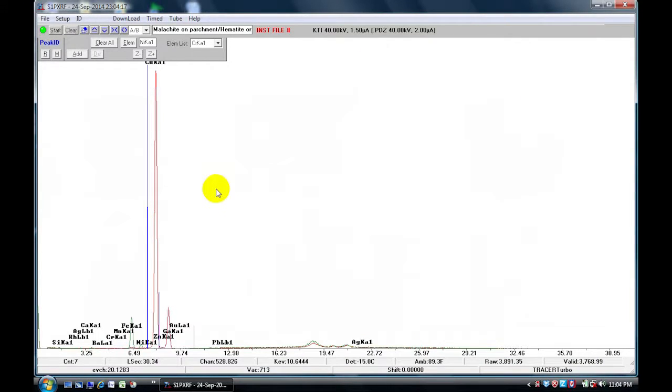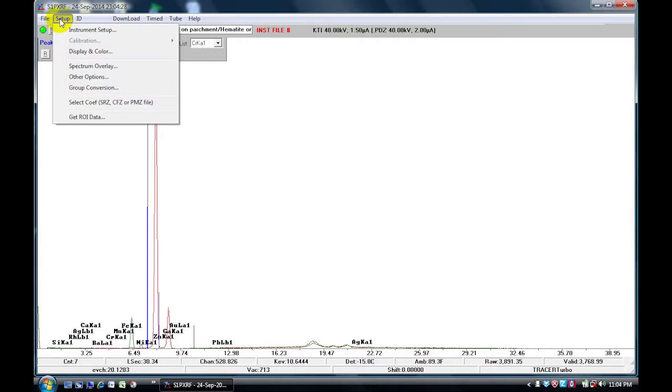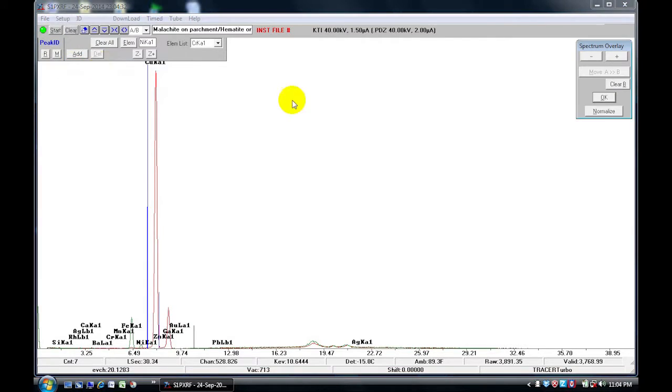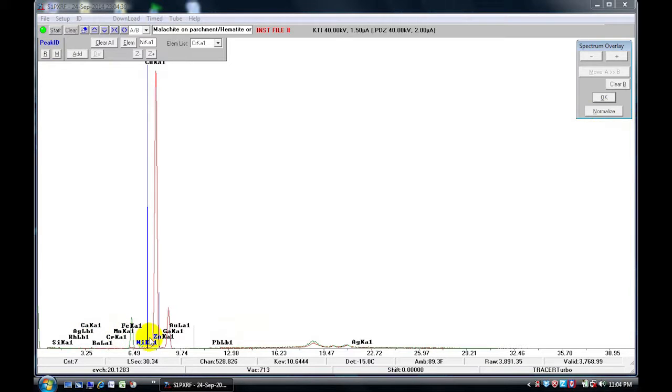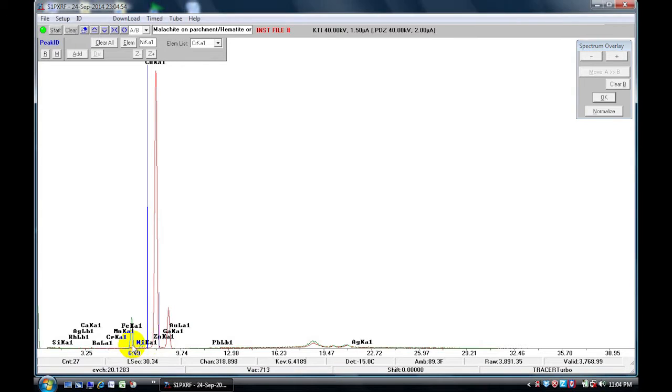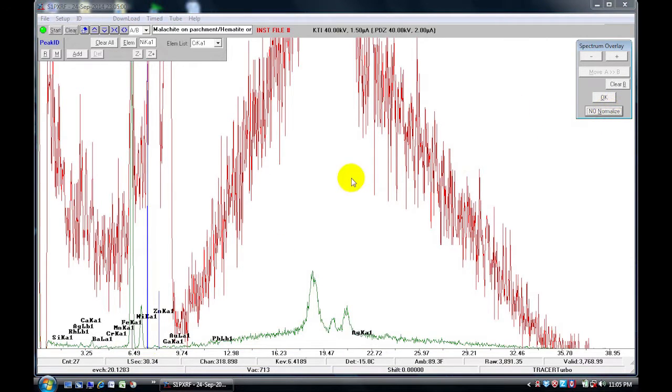Another way to compare two spectra is to normalize them. To do that, we go to Setup, go to Spectrum Overlay. You will notice that we have a Normalize button here. Now to normalize, we have to choose the peak that we want to normalize to. So for example, here I'd like to normalize it to the Iron Peak, for example the Iron K Alpha Peak. You need to click on that peak and then hit Normalize, and then that will normalize it to your Iron Peak.